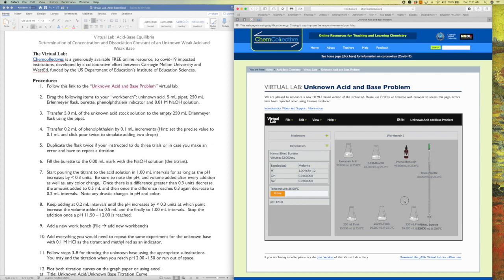So I will hover my burette over the flask that I am going to titrate, and until I get the plus sign, right? I got the plus sign, so we are ready for the titration. Now, the question is, by how much volume do we want the increment? What volume increments do we want to use to do the titration? And so what I'm going to do is start with increments of 1 milliliter.